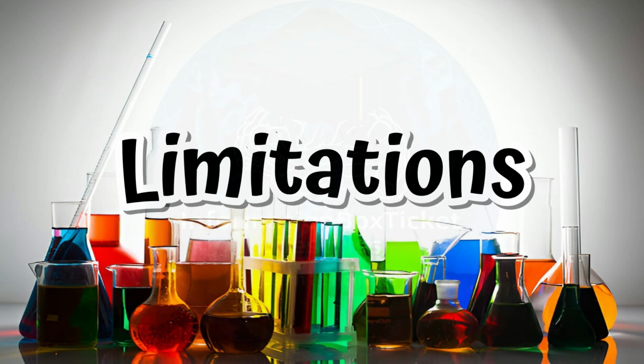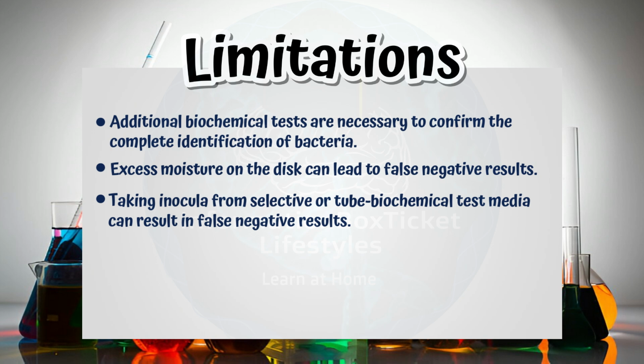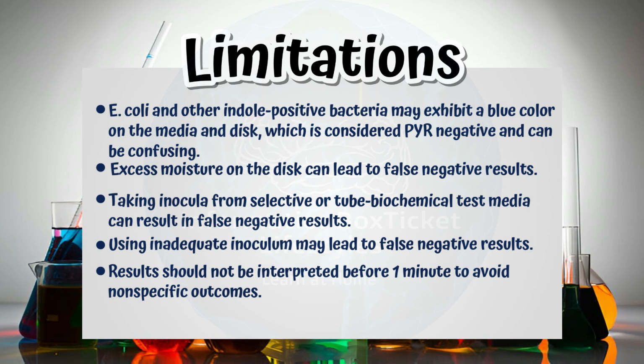Limitations of PYR test. Additional biochemical tests are necessary to confirm the complete identification of bacteria. Excess moisture on the disc can lead to false negative results. Taking inocula from selective or tube biochemical test media can result in false negative results. Using inadequate inoculum may lead to false negative results. Results should not be interpreted before 1 minute to avoid non-specific outcomes. E. coli and other indole-positive bacteria may exhibit a blue color on the media and disc, which is considered PYR negative and can be confusing.